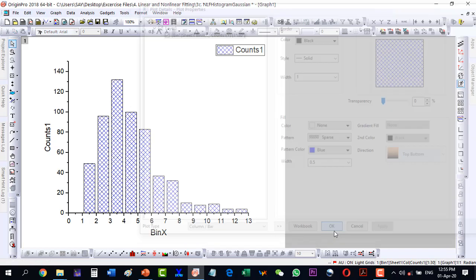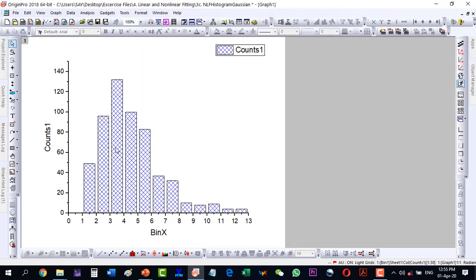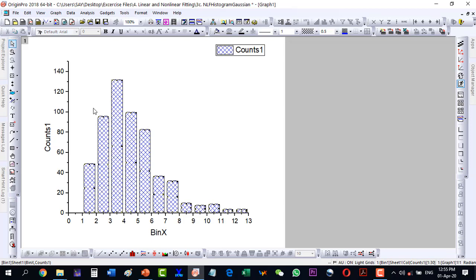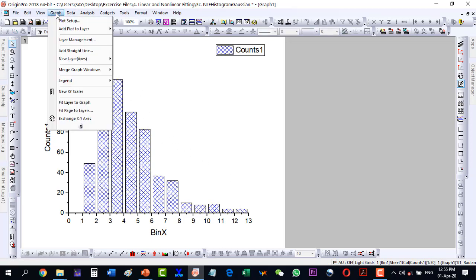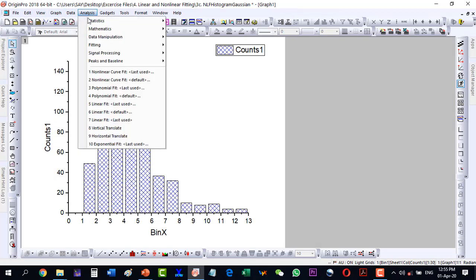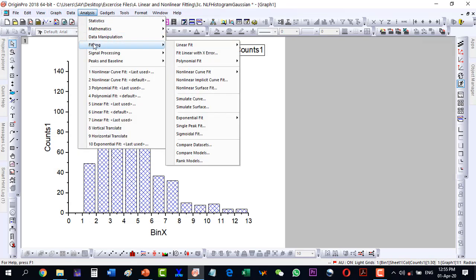Now I would like to fit this with a Gaussian fit, because normally the nanoparticle distribution we fit with a Gaussian fit. So here let's go to Analysis, then Fitting, then Nonlinear Fit, and then Open Dialogue.